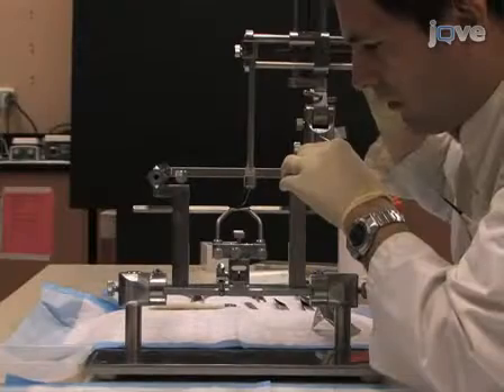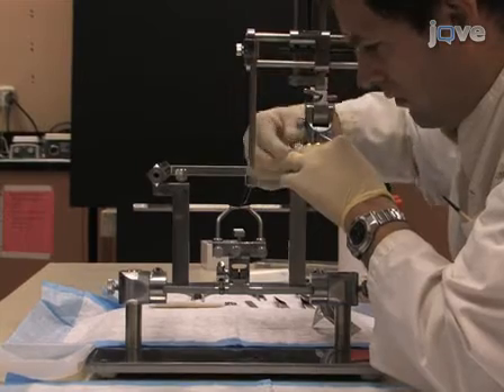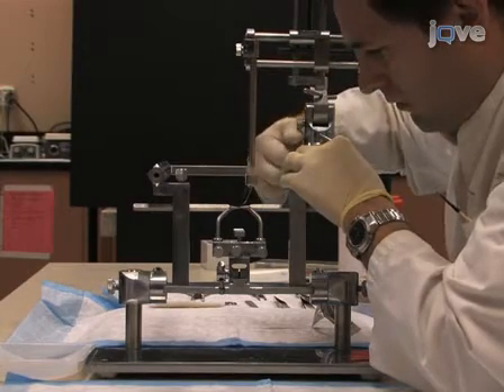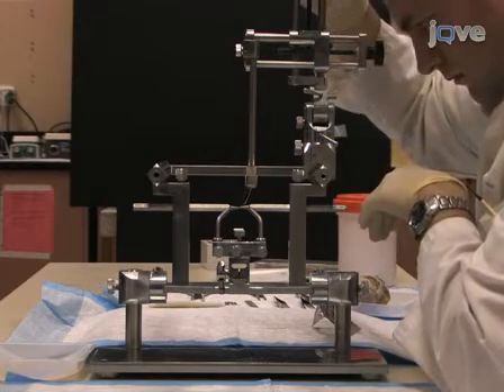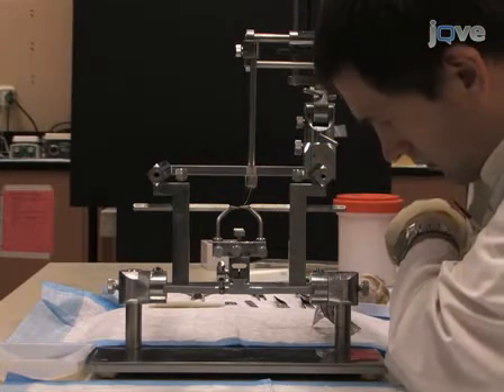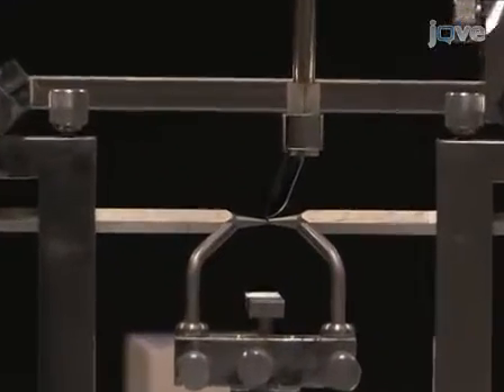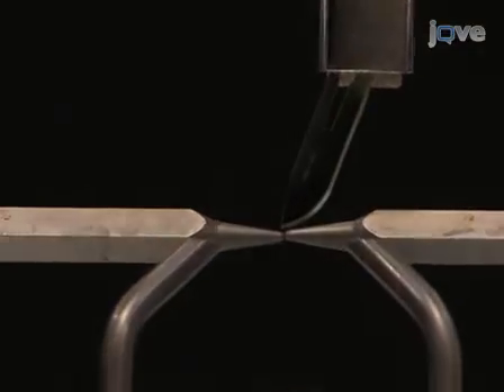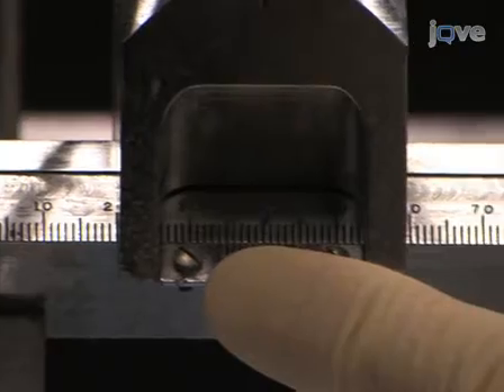This protocol begins following euthanasia, fixation, and decapitation of a vervet monkey. Prior to brain removal, the stereotaxic frame must be prepared. First, one needs to find the coordinates of the Horsley-Clark interaural plane zero, or the theoretical midpoint between the ears. To measure this plane, fit the ear bars equally into the apparatus, then place a scalpel blade in the stereotaxic manipulator arm and measure the midpoint between the ear bars.